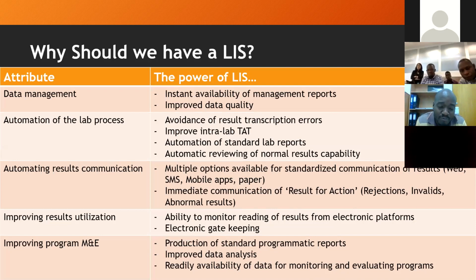It also provides a platform for automation, to automate laboratory processes. And when you automate, you avoid errors like result transcription, where you don't have to enter the results manually, but the results are transmitted electronically from an analyzer.